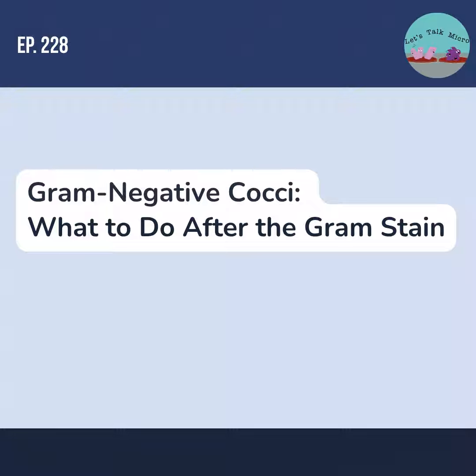And I have seen scenarios where people are working on a urine culture, they look at the MacConkey, there's no growth, they look at the blood agar, and they see the small colonies, they think the plate is too young. They assume it's a gram-positive cocci that is too young. They say too young, and they reincubate the plate. And then the next tech comes in, and they look at the plates and say, well, it still looks too young, let's reincubate.